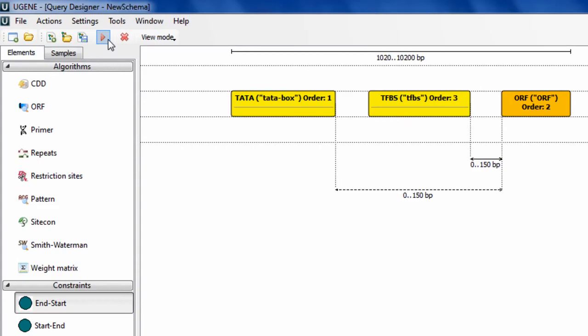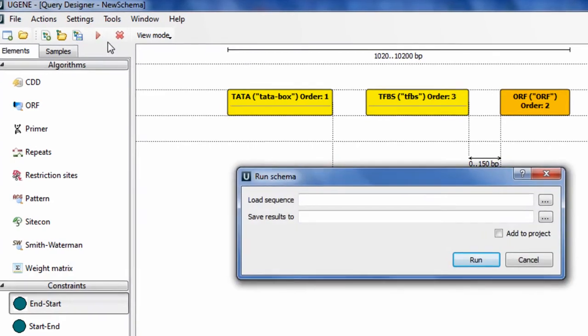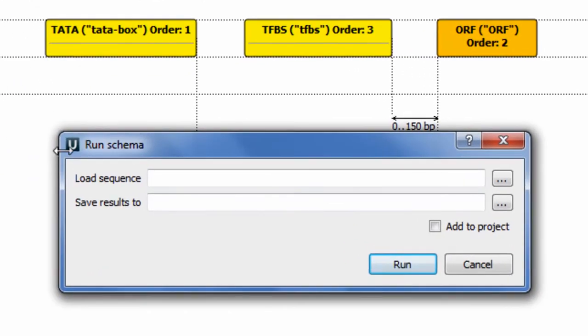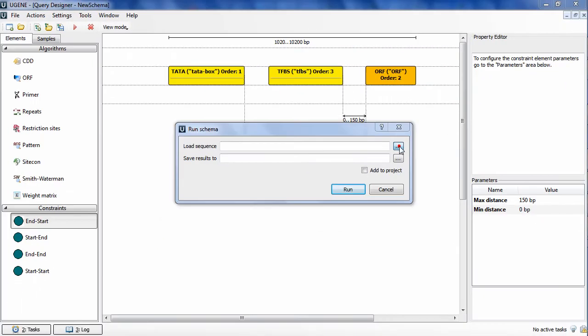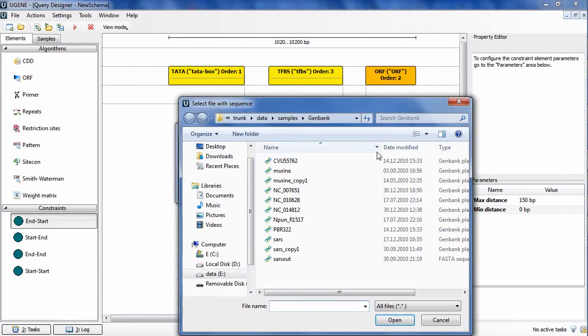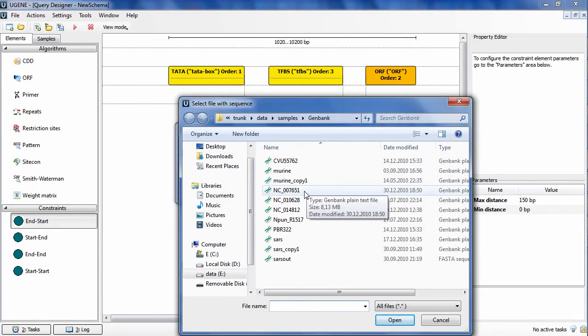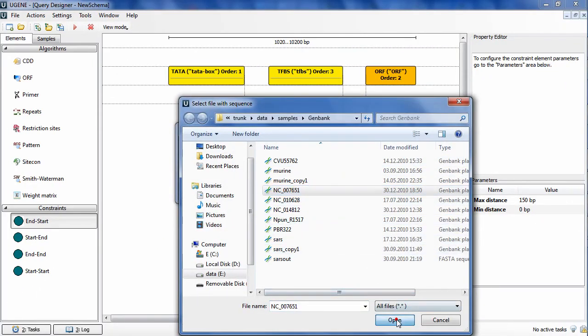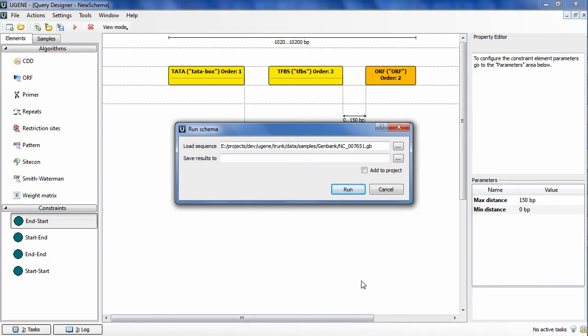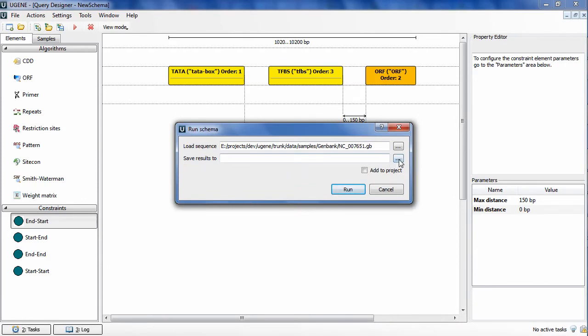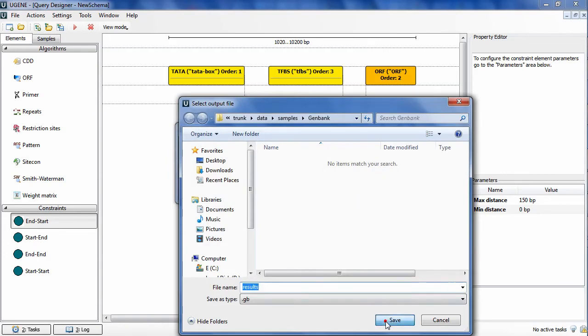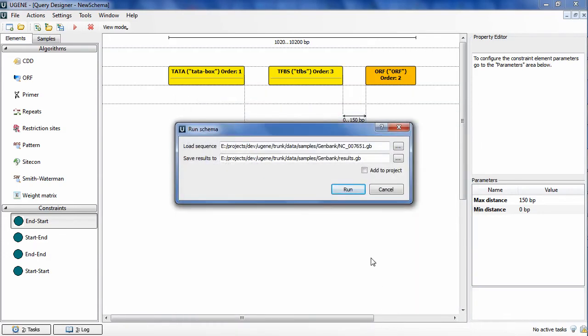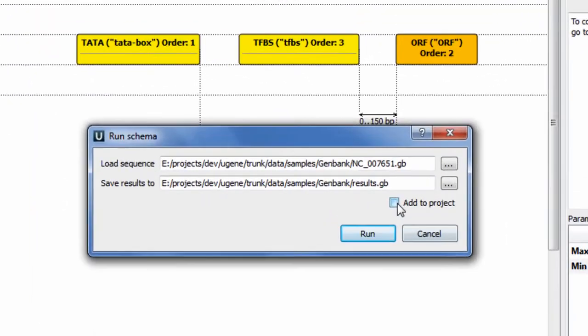I press Run Schema. Before the schema is executed, I need to select the sequence to search through. Also, I need to specify the Genbank file to save the resulting annotations into. By checking the Add to Project checkbox, I will be able to see the search results right after the search is done.